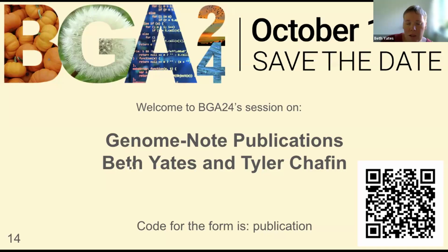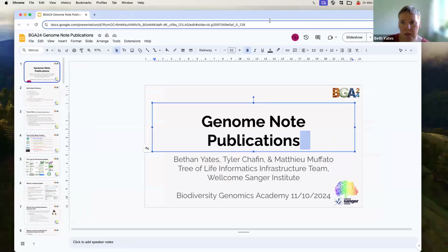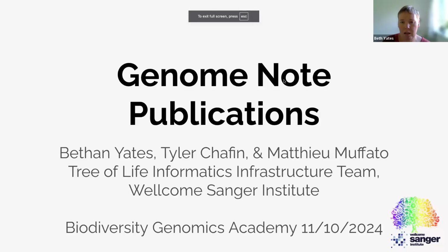Hi. My name's Beth Yates. I'll be presenting today. I'll just start sharing my screen. Can everyone see a slideshow? Perfect. So I'm a bioinformatician in the informatics infrastructure team, and I work with Tyler, who's another bioinformatician who works primarily on our Nextflow pipelines that get used in production.